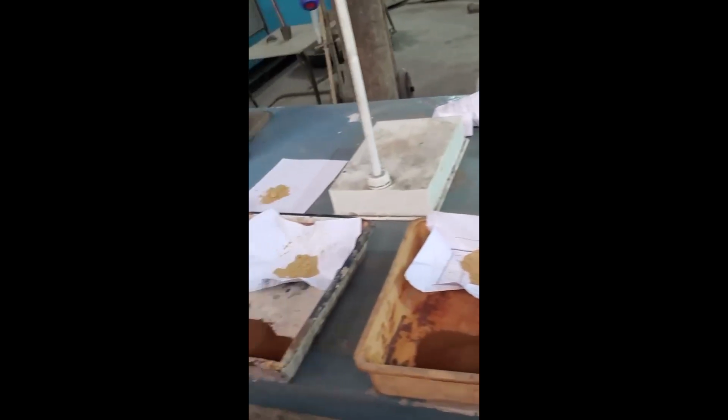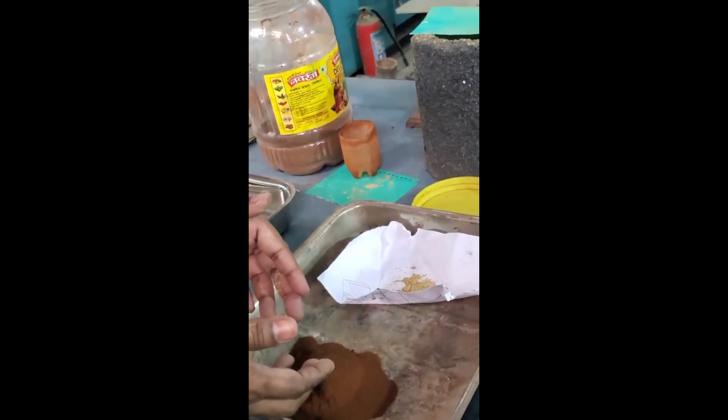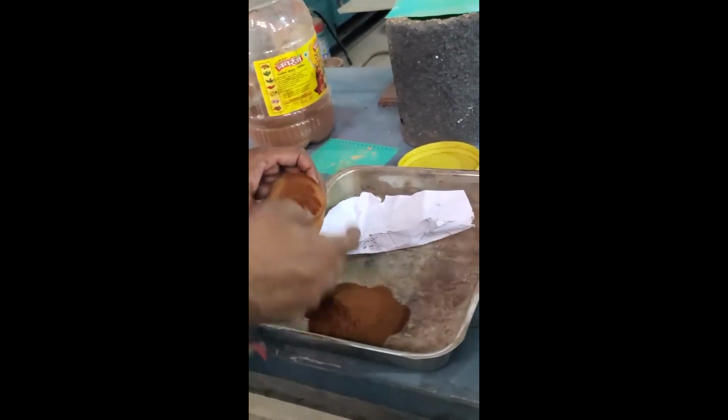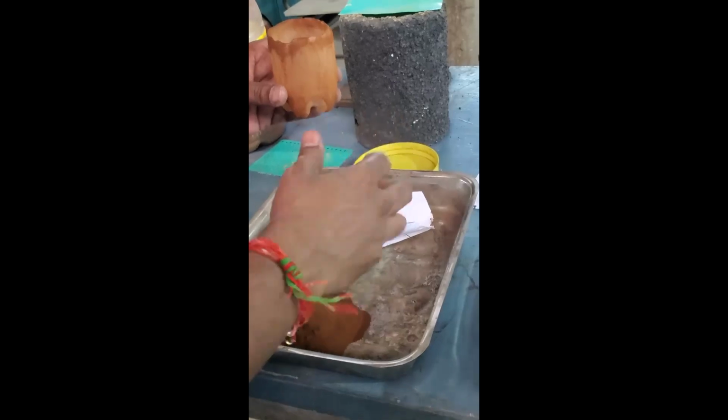For making the pellets, first we have to mix this iron ore powder and bentonite to get a homogeneous mix. After that we add water, and then you will get the best pellet, totally mixed. For mixing, if you are taking any one container, put the iron ore, put the bentonite, just mix it properly, then it will give the homogeneous mix. That we will see.